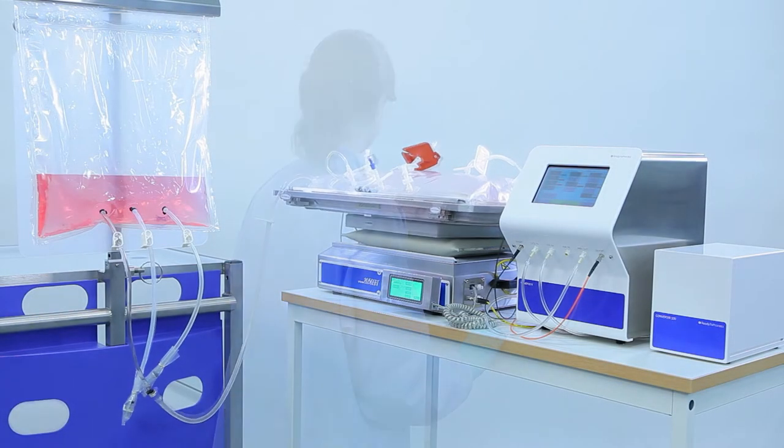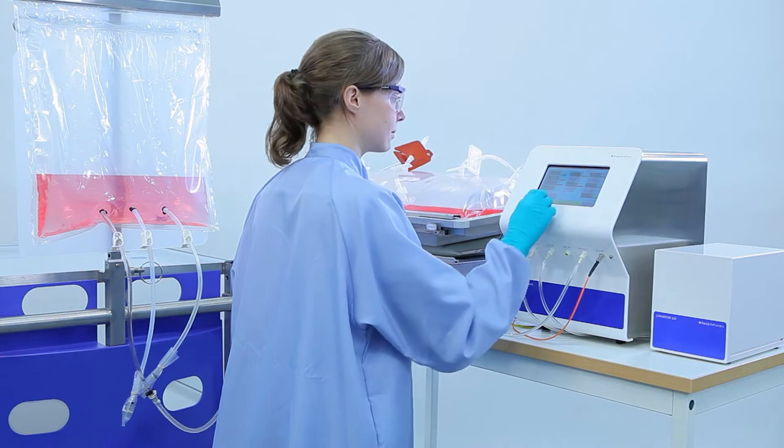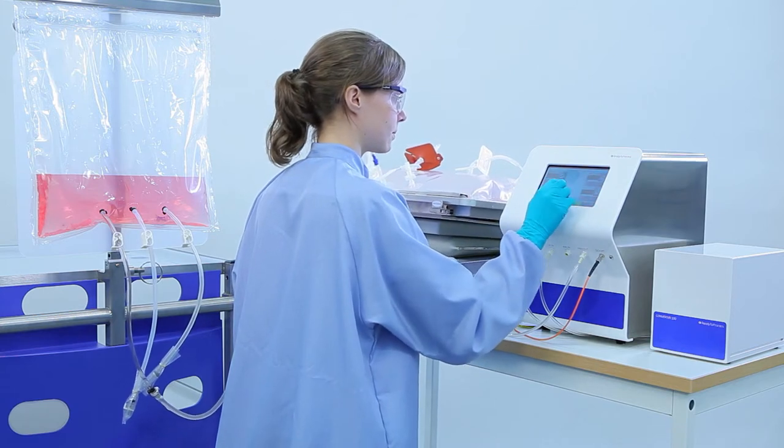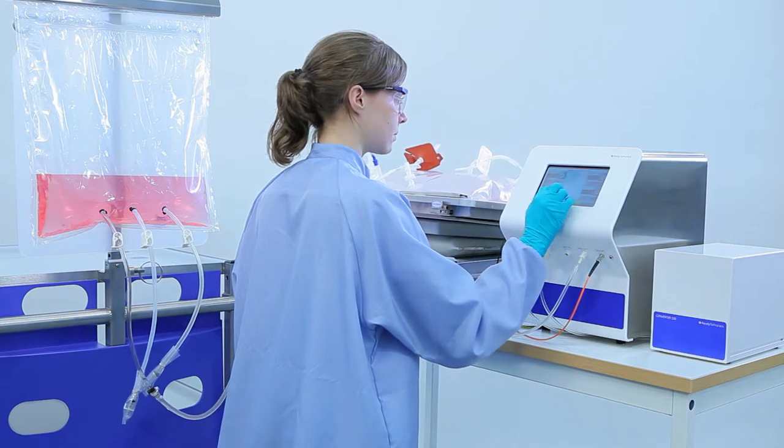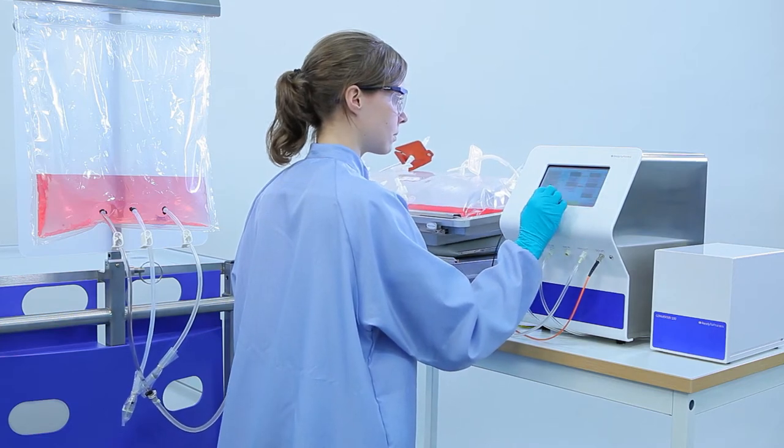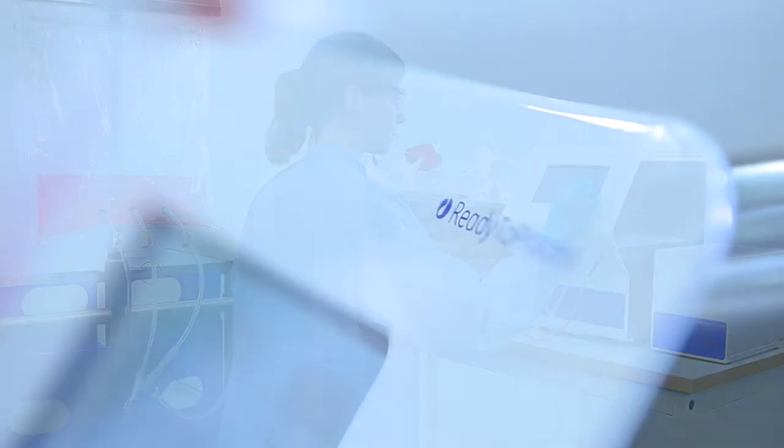With a growing demand for on-time execution and flexible operations, companies are introducing disposable and ready-to-use solutions into their production. Cytiva's ready-to-process platform of ready-to-use products brings flexibility and speed to upstream and downstream processing of biologicals.